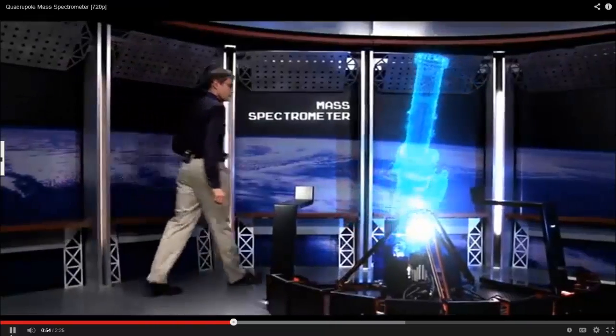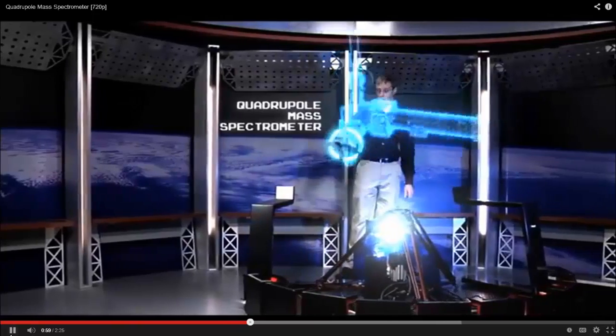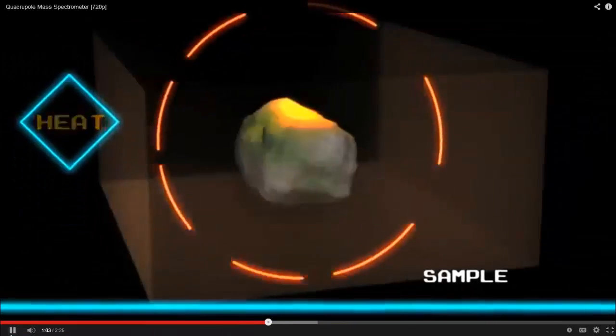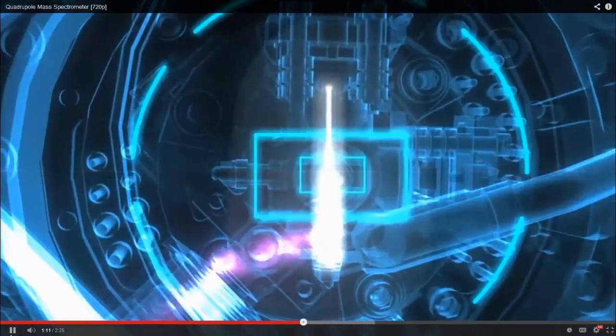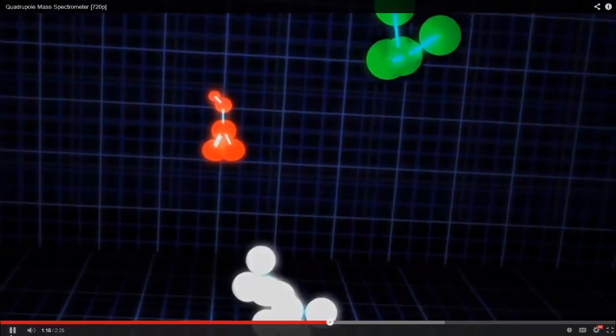Today we'll be looking at a special kind of spectrometer called the quadrupole mass spectrometer. It's called this because of the four long poles that make up the center of the instrument. So say you have a sample that's been turned into a gas, and you want to find out if it contains certain things. The gas is sent into the mass spectrometer, first hitting a piece called the ion source. Here, a stream of electrons hits the molecule, breaking it into fragments and giving each fragment a charge.